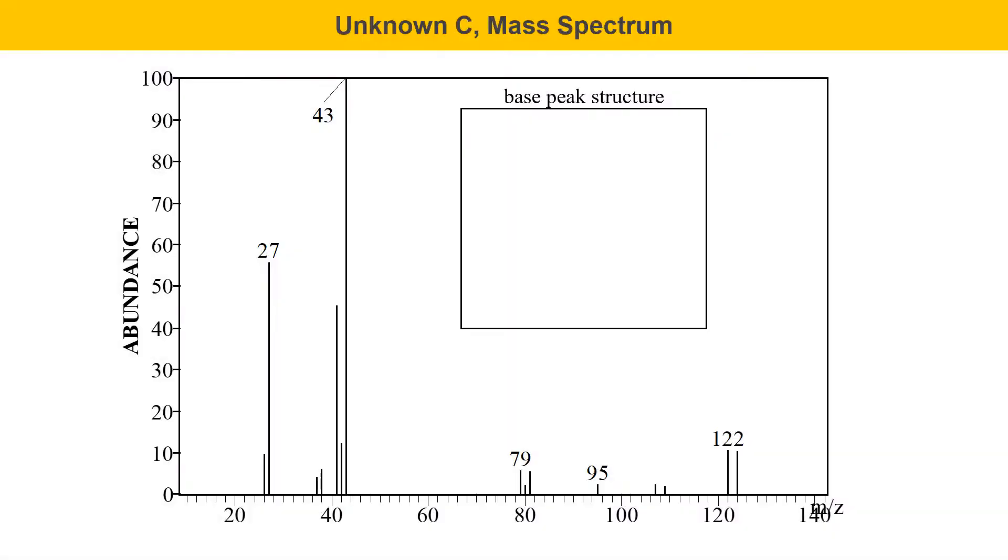Now, moving on to unknown C. Here's the mass spectrum of unknown C, and something significant here is the molecular ion region. There are 2 peaks here of roughly equal intensity. The first one is at 122, and the second one is at 124. You have to read the X scale carefully to get this, but each tick mark on the bottom is actually 2 mass units. So, 2 peaks of equal intensity separated by 2 mass units. That's trying to tell you something significant.